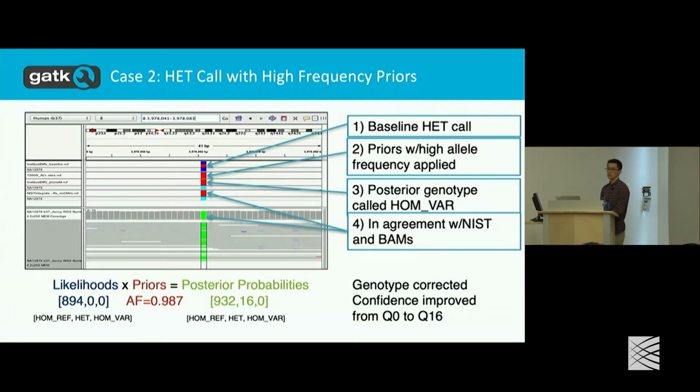Isn't the higher Phred score usually meaning that you have more confidence, base accuracy, so that you're more confident? Yeah. So Q0 means it's a toss-up. Q0 means that if you take the ratio of the most likely probability to the next most likely probability, it's 1.